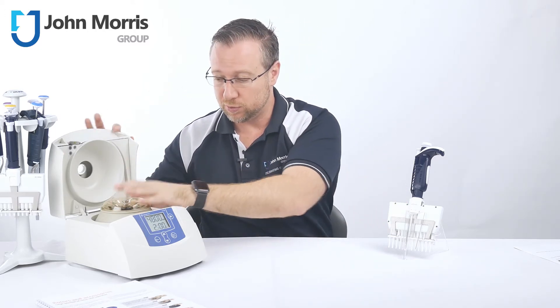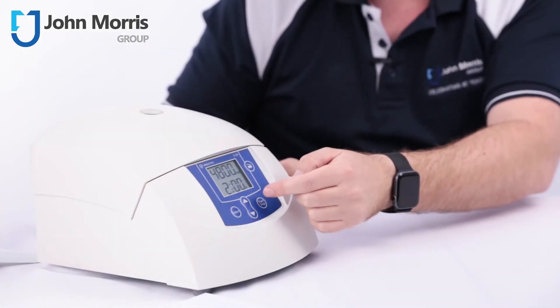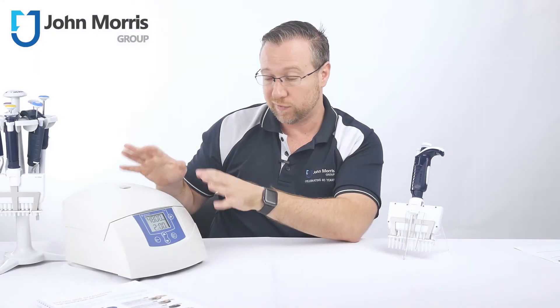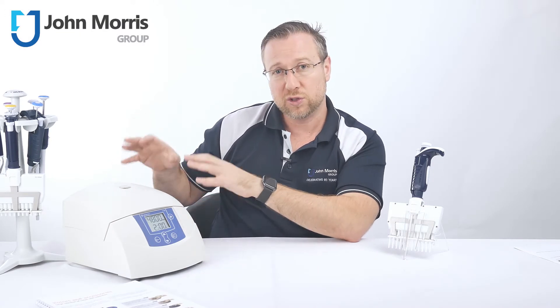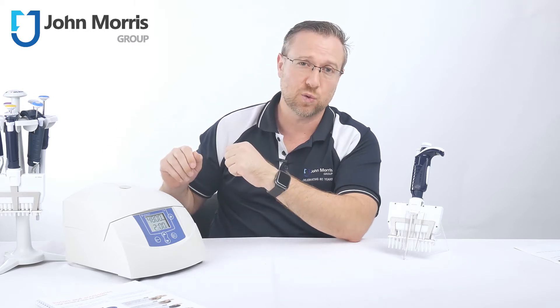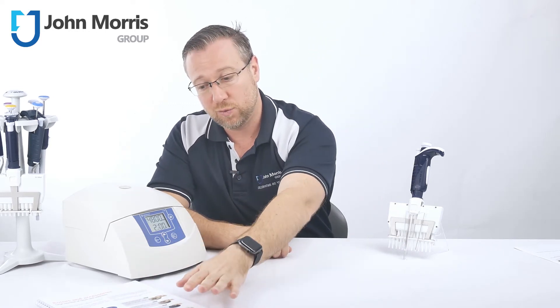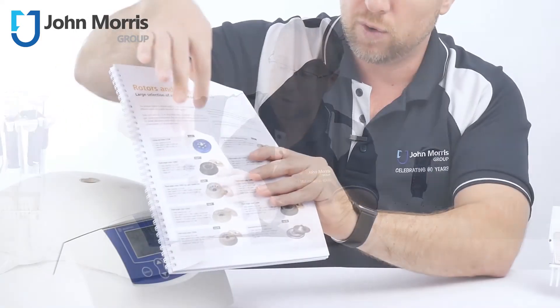Once your rotor is in and your samples are in, close it and simply push start if you're happy with the program already set. This unit comes in two different varieties: a refrigerated version and a non-refrigerated version. The non-refrigerated version is less than 54 decibels when operating, while the refrigerated version will be under 49 decibels. As you can see, there's a range of 10 different rotors, including, if you want, even a small swing-out rotor.